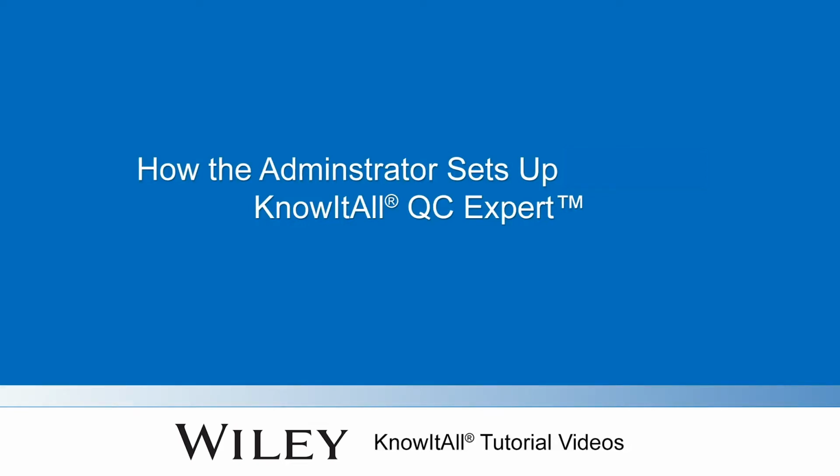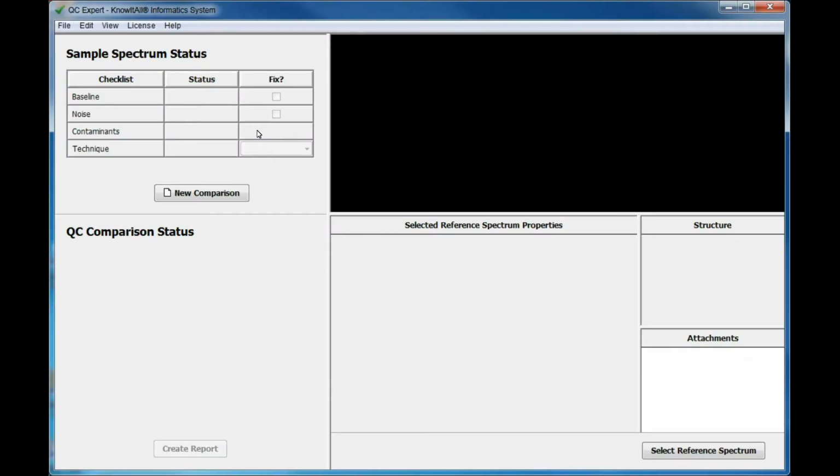Welcome to a demonstration of how administrators set up the KNOWITALL QC Expert application. Before QC Expert can be used, an administrator must set up user accounts. Choose File, Digital Signature Administration.